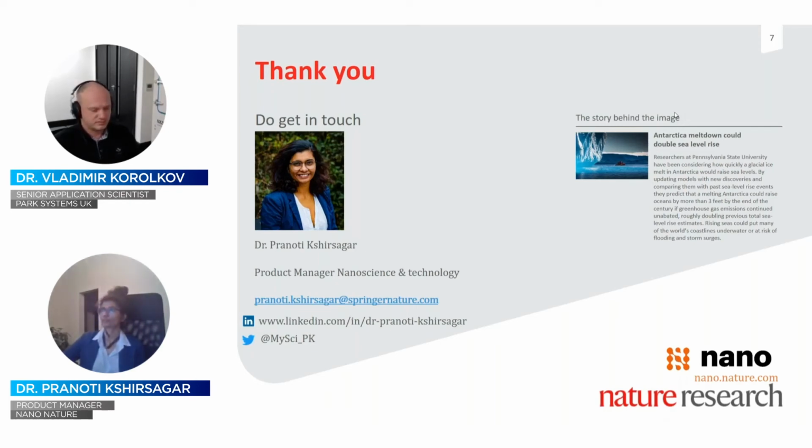Yeah, that's a very good question actually. We basically try to extract as much information about the nanomaterial as possible. So its dimensions, the medium in which that property was evaluated, or the support system, if there is any. This is for the property section. Then for the biological systems, as much information as has been given by the authors, we try to extract all of it or most of it.